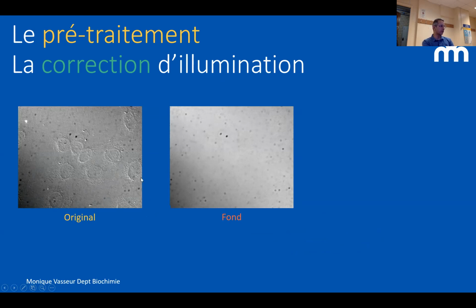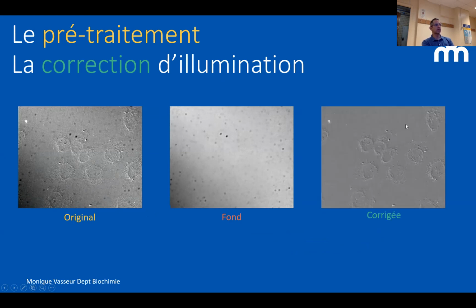there is dust a bit everywhere on the camera. You can actually calculate what is the background of this, and you can subtract it, and it's very good to remove all of these artifacts. Is this okay to do that? Yes, as long as you have this picture.